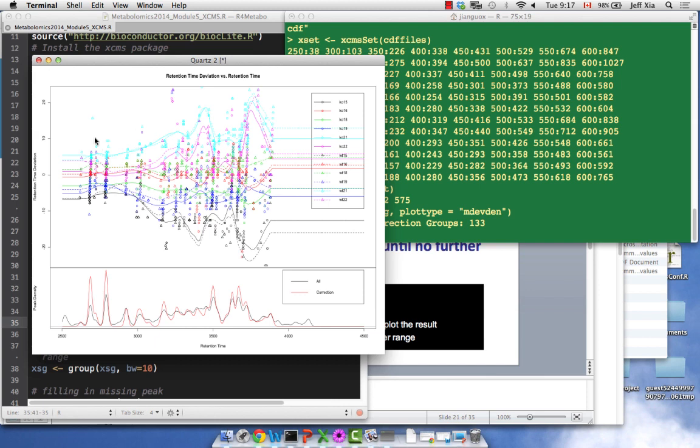Do you have more questions about this graph? This is probably the main graph. This is the graph I was referring to at the beginning. If we have thousands of spectra and plot them, we can see this drift very densely packed. Is there a way for us to plot something like this? Yeah, it's not offered by XCMS. Okay, I see your question.